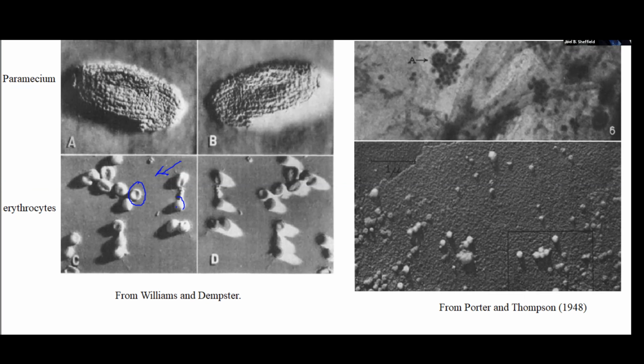And once again, you have this interesting shadow effect, in which case here you'd assume that the direction of shadow is like this, the direction of evaporation, okay? Whereas in this image, it's going the other way. Okay, so that's one way of looking at it.